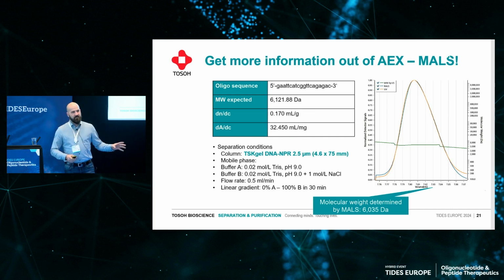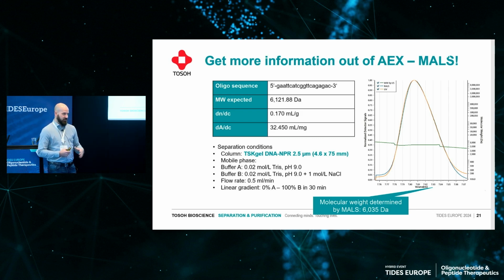And the idea is not really that this replaces mass spec in any way, but I think that could be a nice application moving forward to help with peak fractionation in a PAT setup. So you would not attach this to your HPLC during the analysis, but you can attach this to your purification skid to measure the molecular weight in real time and then perform peak cutting based on the average molecular weight, which gives you a better way to optimize your purification process and increase recovery or increase the purity.